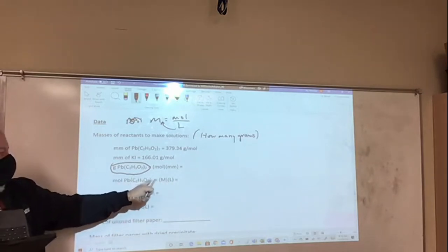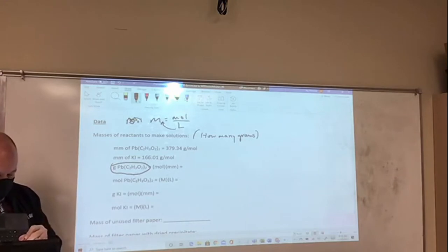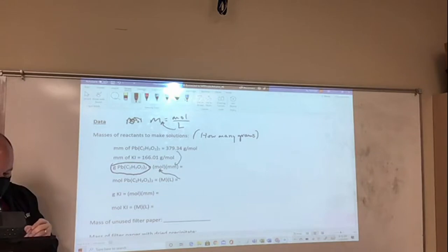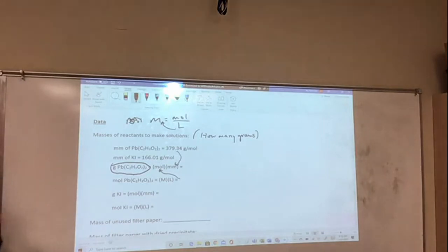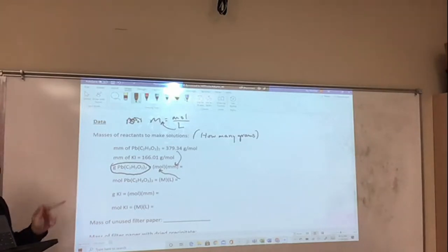So I need to multiply those two things together, and then I'm going to plug that answer into there, and that's going to tell you exactly how many grams you need to make that first solution.